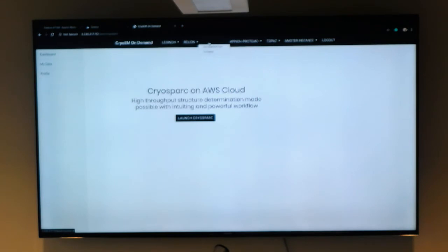If you want to take a picture, you might want to go to the back and see, there's actually people doing this in real time.